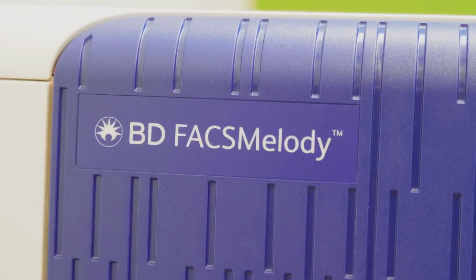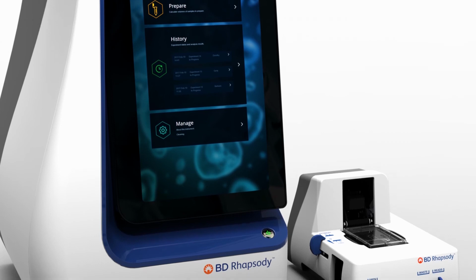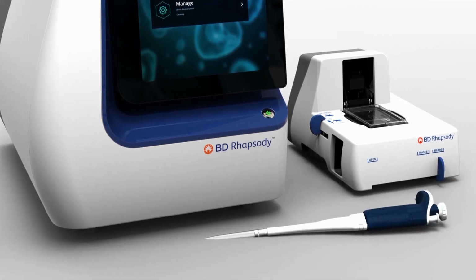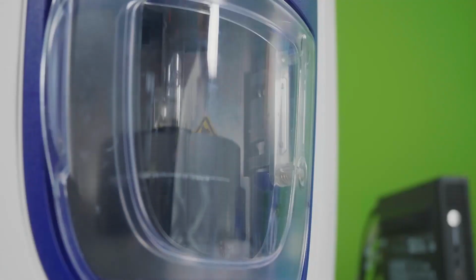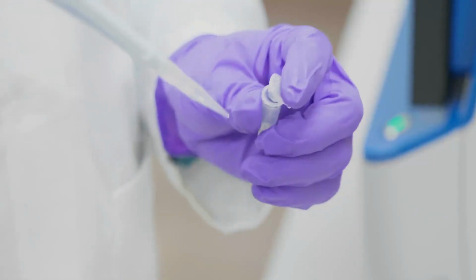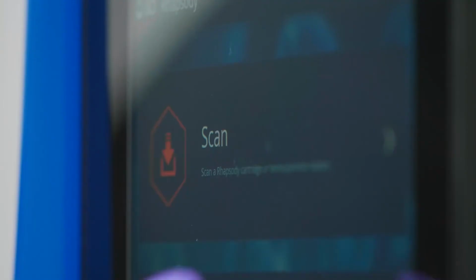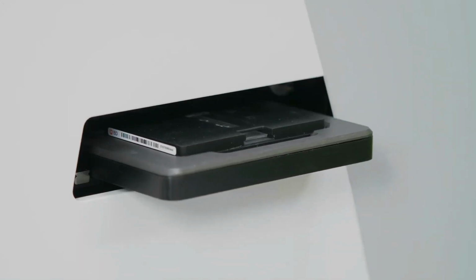This video showcases the perfect interplay of the BD FACSMelody cell sorter and BD Rhapsody single-cell analysis system to enable sample enrichment and transcriptome, as well as surface marker expression analysis on the single-cell level. This unique and straightforward workflow helps preserve sample integrity, which is key to generate high-quality data and meaningful biological insights.